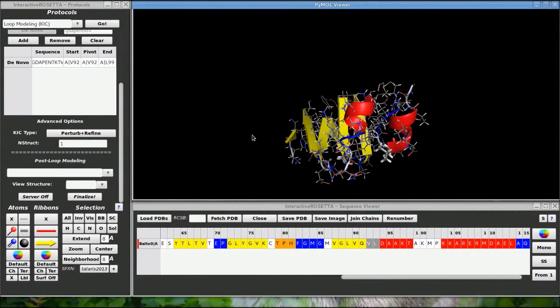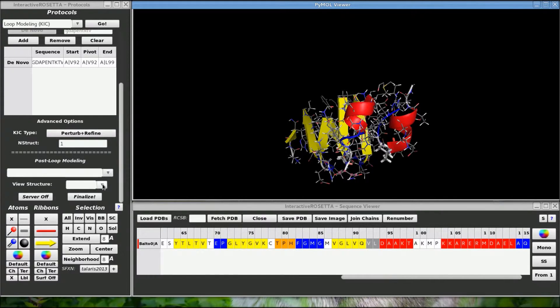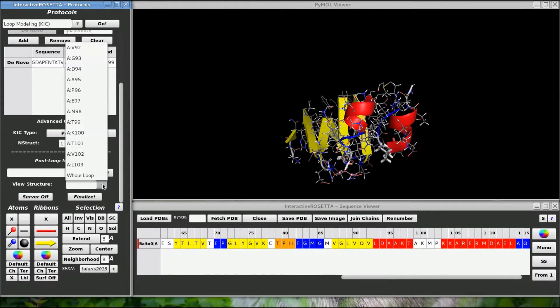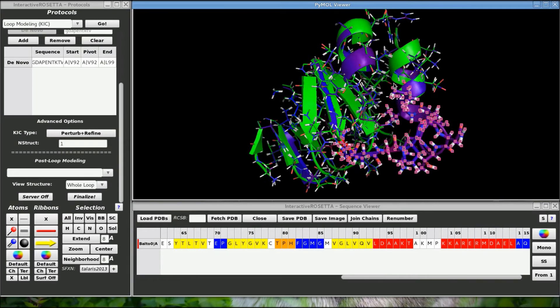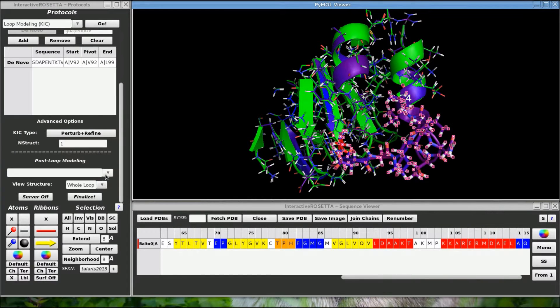OK, it looks like it is done. Before I accept the simulation, I can take a look at specific residues in the loop easily by selecting items in this drop down menu. There is the whole new loop.